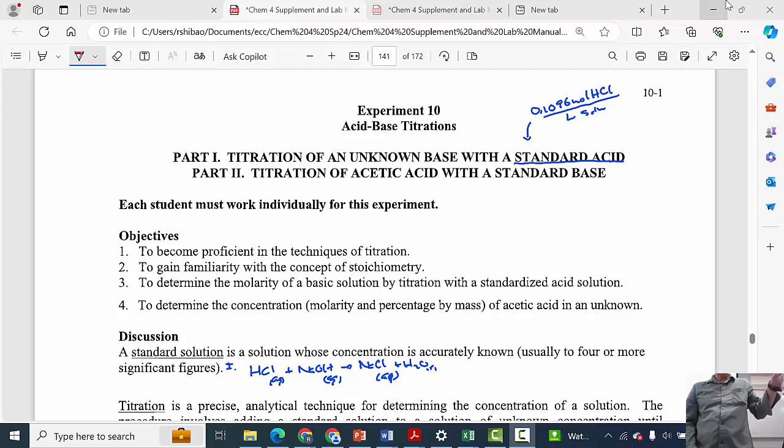For the hydrochloric acid, you're going to bring a 250 milliliter beaker there, and they'll just exchange it for one that contains hydrochloric acid. And then for the sodium hydroxide, we have that in a different container because we don't want to get them mixed up. And so the sodium hydroxide is in this flask. Do you recall what this flask is named? Florence flask. How about this flask?